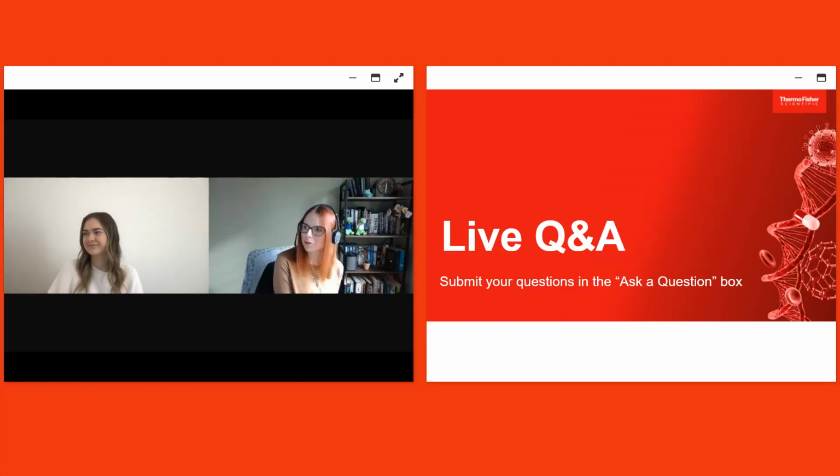Okay, so this probably would have been more of a question for Shakeil, so I will try my best with this one. They are not validated. With any enterprise installation, we share all of the enterprise documentation with you, which Shakeil mentioned in the presentation.